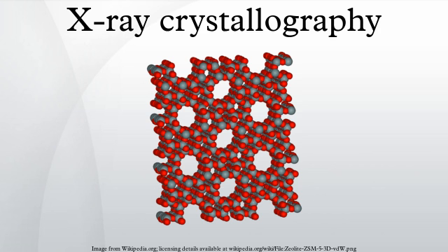In the second step, the crystal is placed in an intense beam of X-rays, usually of a single wavelength, producing the regular pattern of reflections. As the crystal is gradually rotated, previous reflections disappear and new ones appear. The intensity of every spot is recorded at every orientation of the crystal. Multiple data sets may have to be collected, with each set covering slightly more than half a full rotation of the crystal and typically containing tens of thousands of reflections.